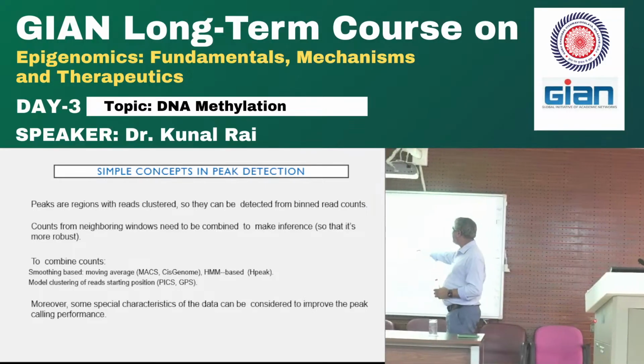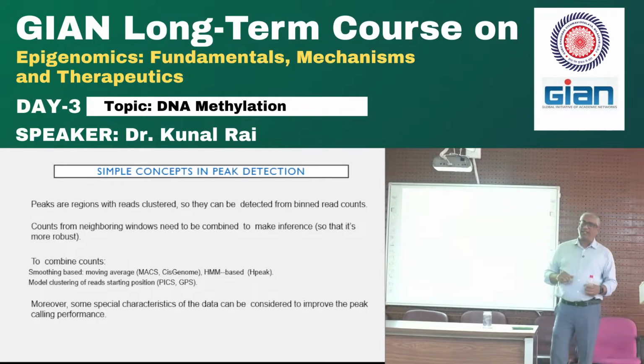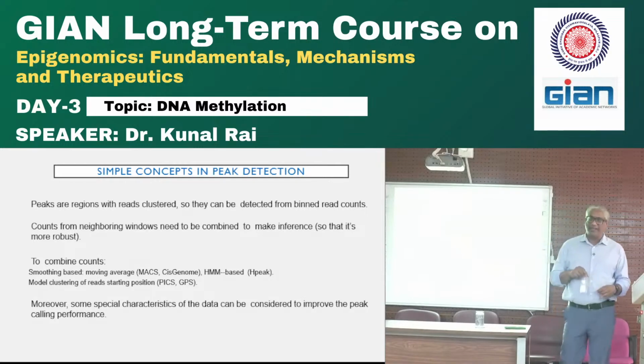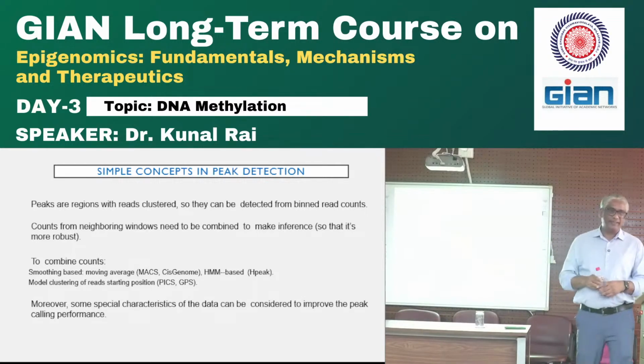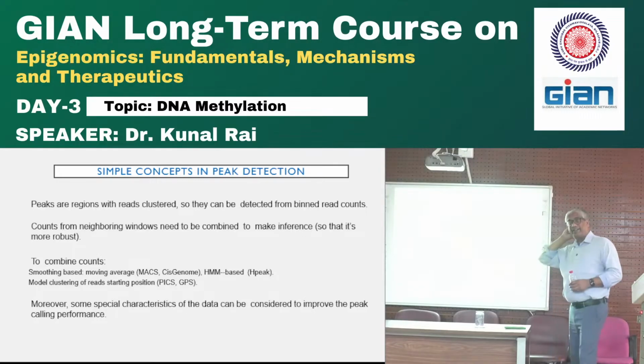But postdocs also think technically, like you guys, so they put a lot of this stuff like that. Basically, peaks are regions where reads are clustered, so they can be detected from binned read counts. There's a lot of wording there, which you guys probably didn't get. How many of you got this? No? All right, then the next 30 hours is going to be torture for many of you.